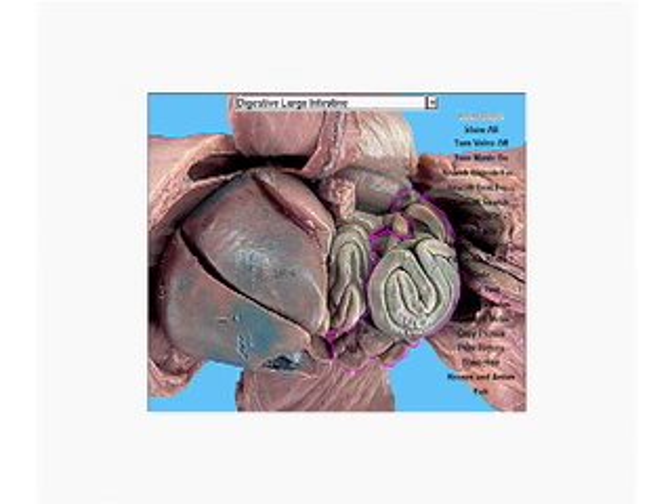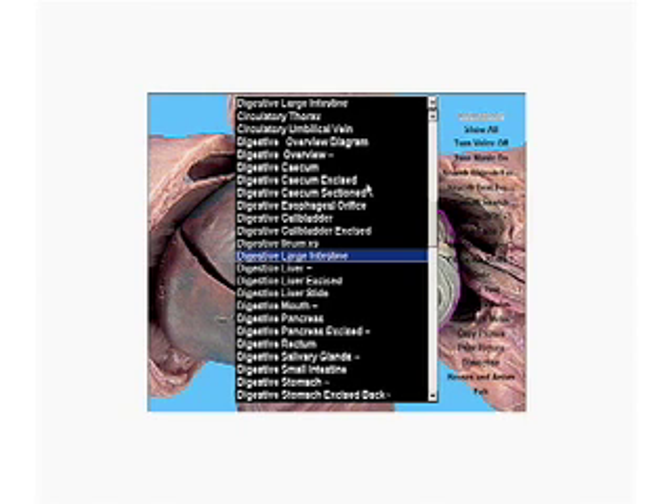Here's the kidney. Small intestine. Large intestine. Colon. We'll see another look at that in the next page.